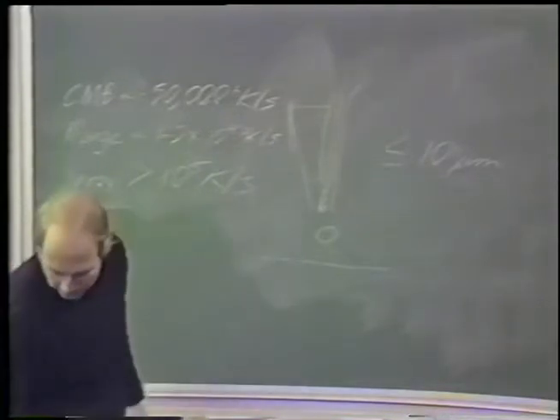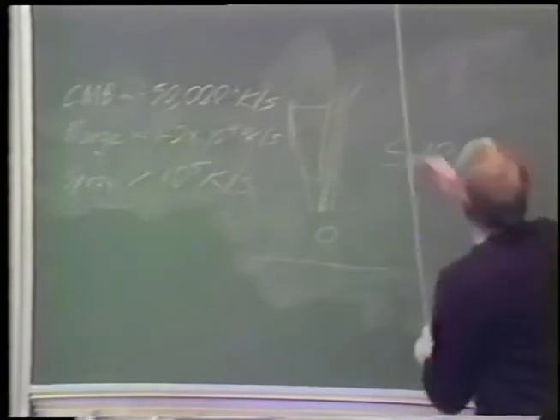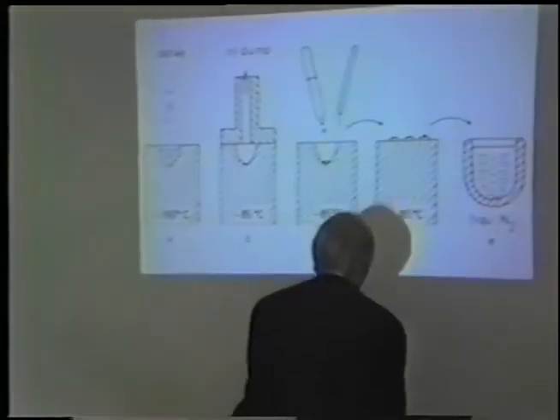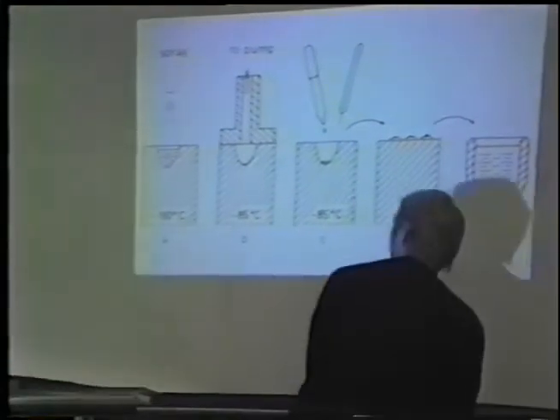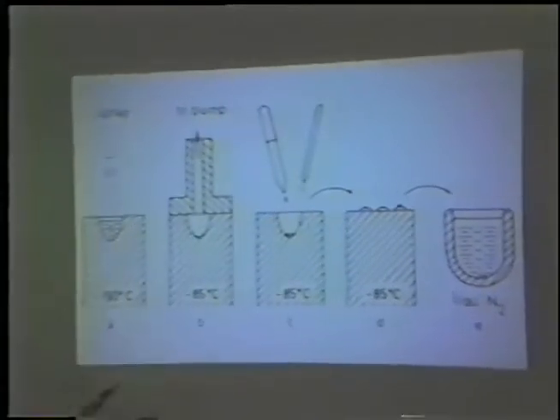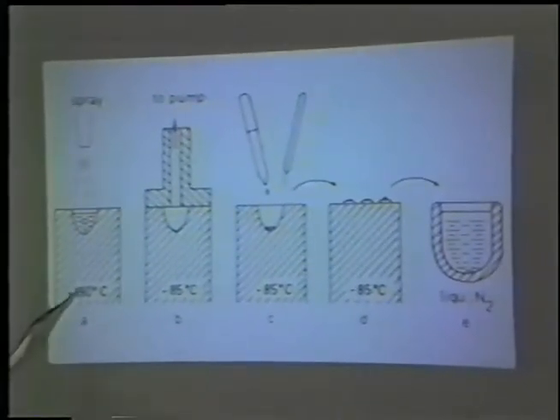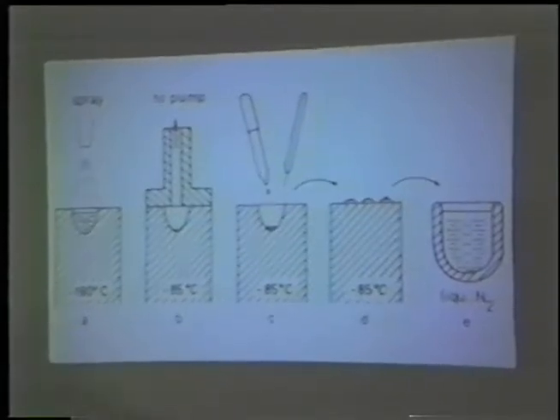I think I actually have a slide of this. Okay. Pointer. Now, here we have the airbrush. Here we have the propane at minus 190 centigrade or whatever temperature.